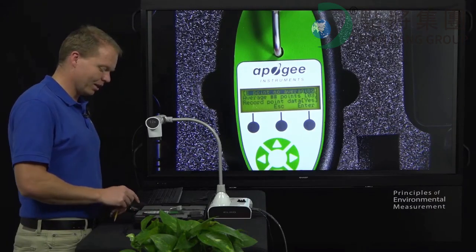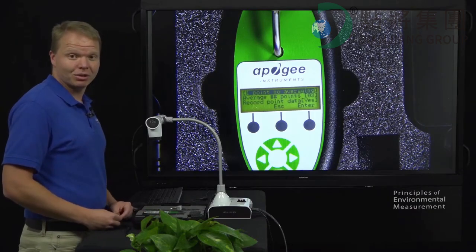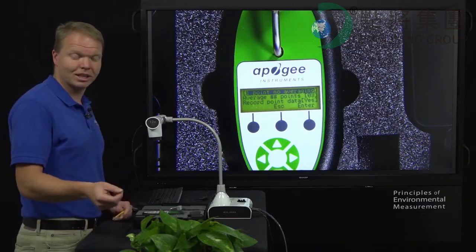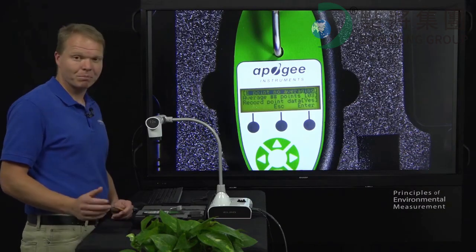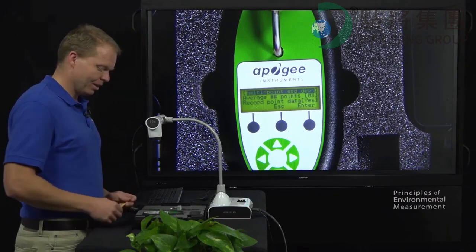So let's start by talking about 1 point no averaging. This means that every time that you take a measurement on a leaf, that is just saving every measurement. Every time you point, it's just taking a measurement. It's not doing any averaging for you. And so this average number of points in recorded point data, they do not apply in that feature.